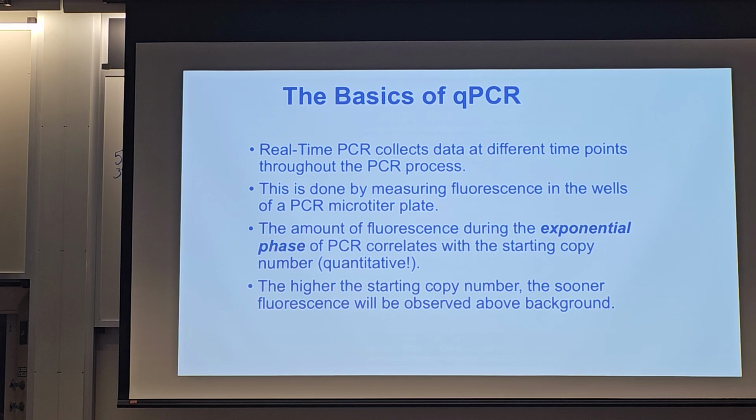And the fluorescence is just so far that it has this region. Yeah, I'm going to take you through that in more detail because we're going to use two different methods. Again, we're not going to take the easy way out here. We're going to show you two ways of doing it. The two most common ways of doing this, the class is going to do both. We're actually going to have one lab do one and one lab do the other.